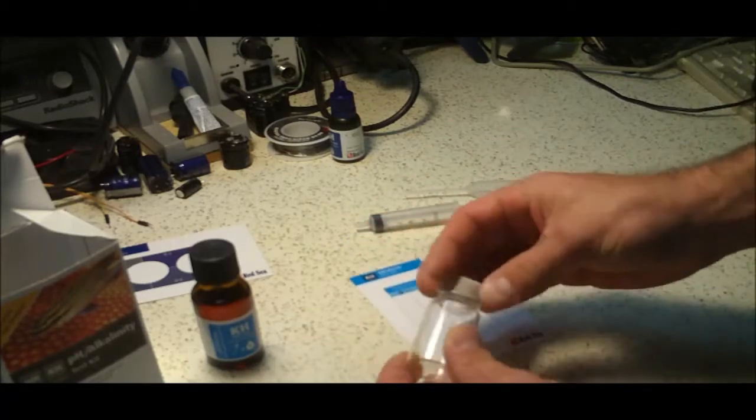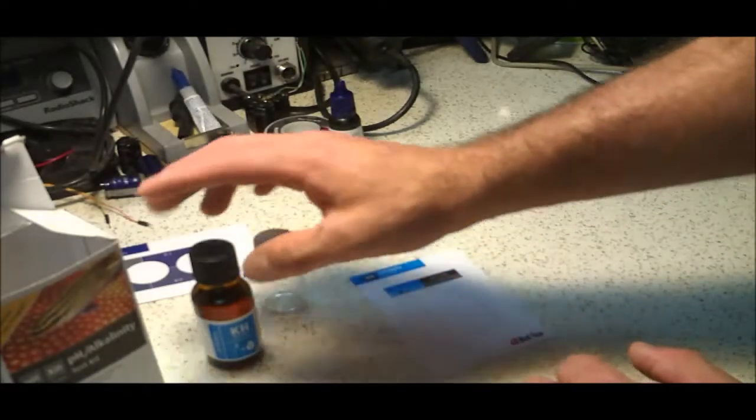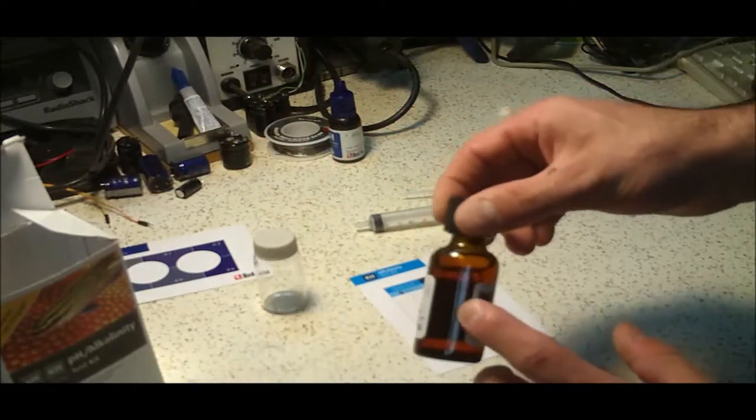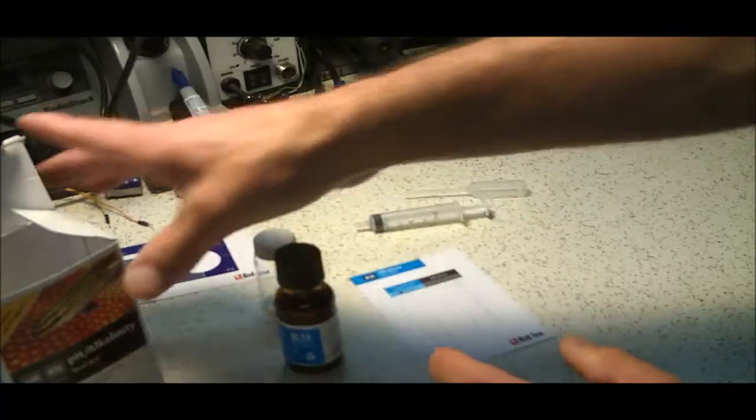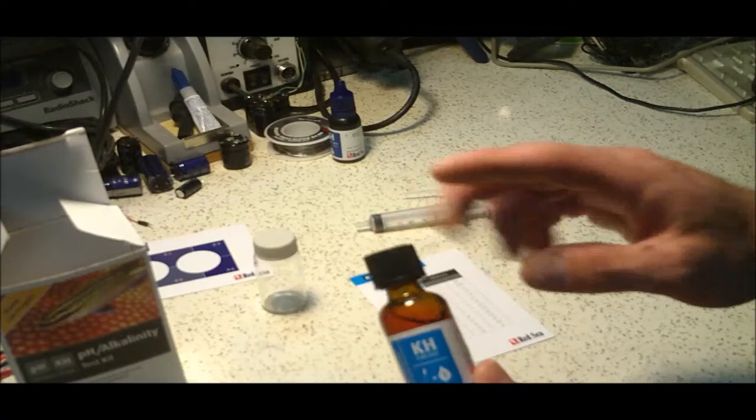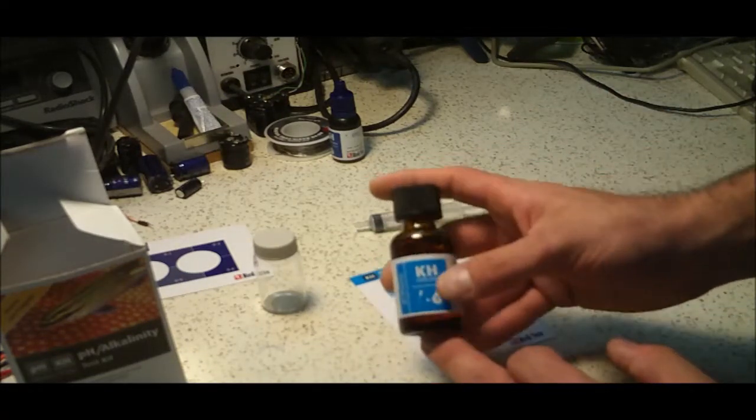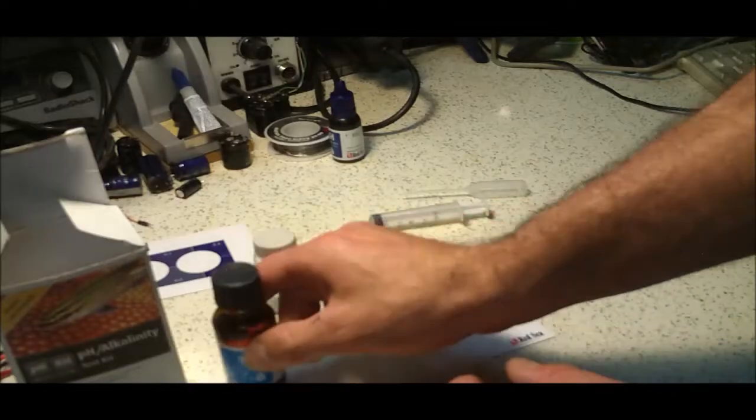As far as the glass vial goes, it seems like all the other glass vials that Red Sea gives, very nice quality. You get a good amount of KH solution. It says it's good for 55 tests. But Red Sea, they mean 55 full tests. So you could probably get actually more depending upon where your alkalinity range is.